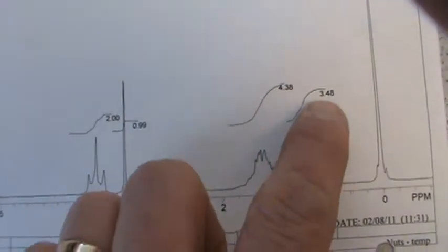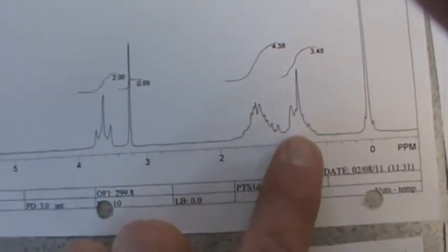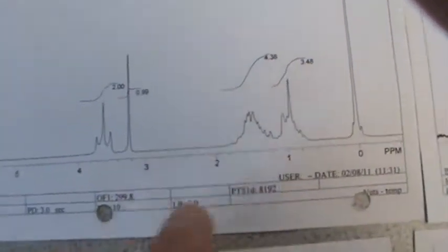What you're going to see there is the 2 CH2 groups are bundled up in there, and this remaining blob, which is close to being 3.4, that's essentially the methyl group. The reason why this is so broad is because some of the coupling that's taking place between one and the next door neighbor is not exactly the same as the other neighbor. And that's why you're not getting a nice N+1 peak. But you can make out from the integration, this is butanol. Key peak we're going to look at is right there at 3.6-ish, right there in our product.